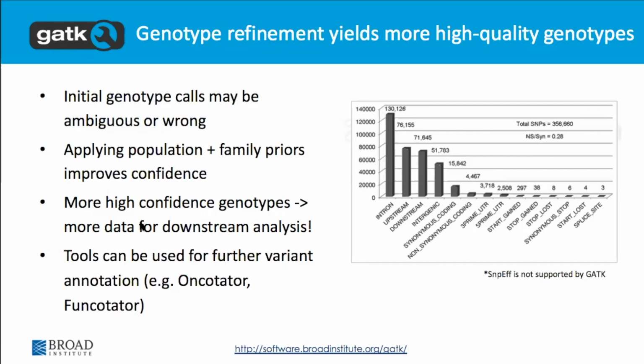We're not going to cover it in detail in this workshop, but if you need to do any functional annotation, which you probably will, Funcotator is the go-to tool now. It's a very new tool in the sense that it came out of beta development in January of this year, released into production-worthy status with version 4.1. And there's a blog post on the GATK blog that gives you an overview of what it does and lists resources to help you use it.